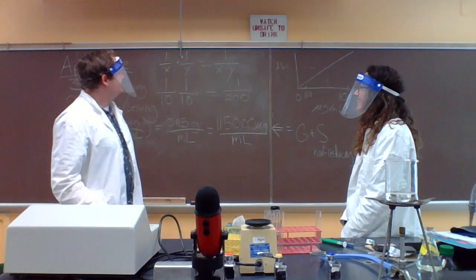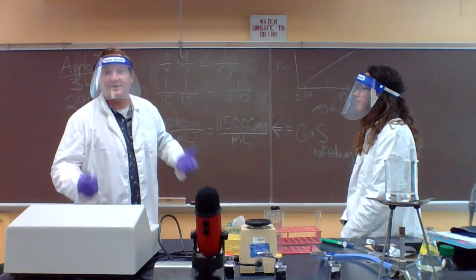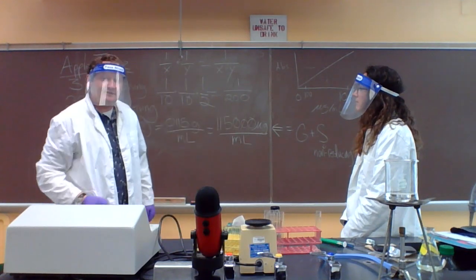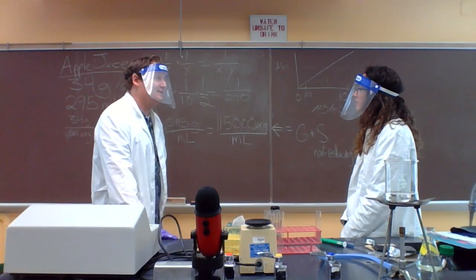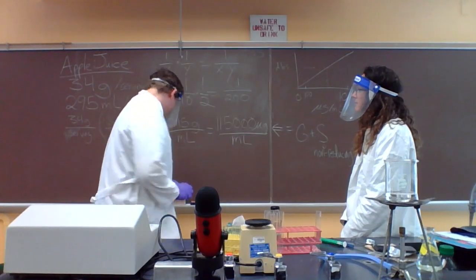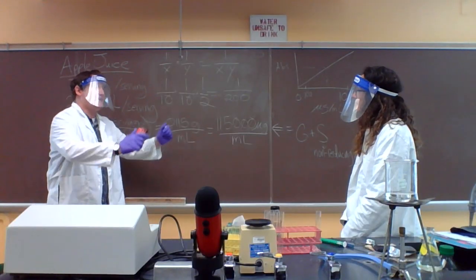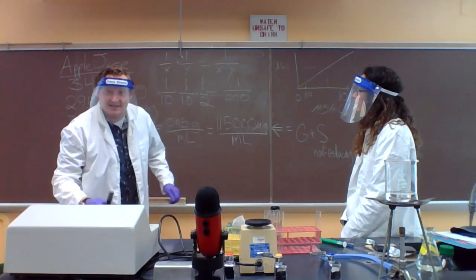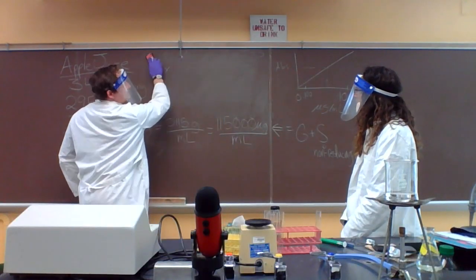All right. So now we've taken care of a 1 in 100 dilution. This right here is equivalent to a 1 in 100. Then we add a 1 in 2 dilution, or a 1/2 dilution, and all of those multiply out to make a 1 in 200 dilution. Now there's one more trick here. Using a serial dilution, we make the first dilution, and then we take out of that now diluted tube and use that to make the second dilution. So really quick, I'll draw that on the board to clarify, since this is a very confusing topic for a lot of people.